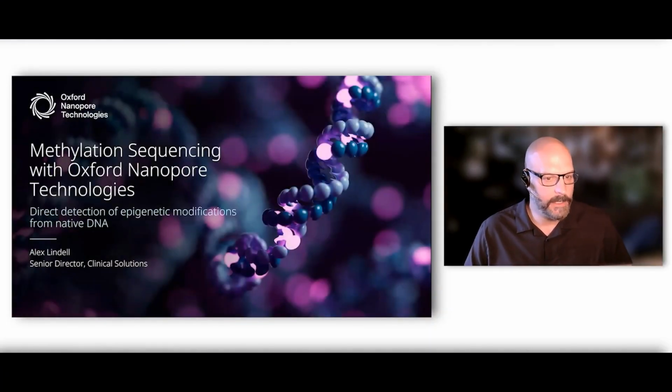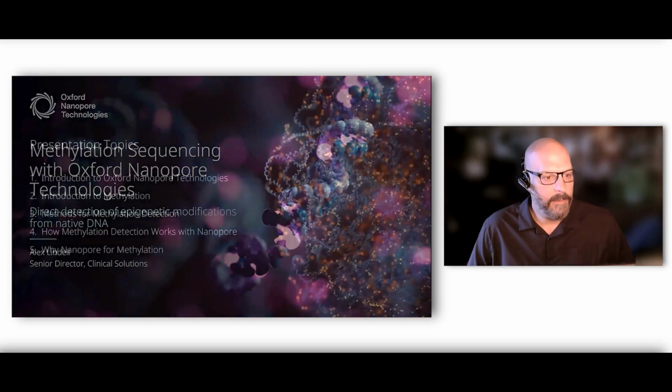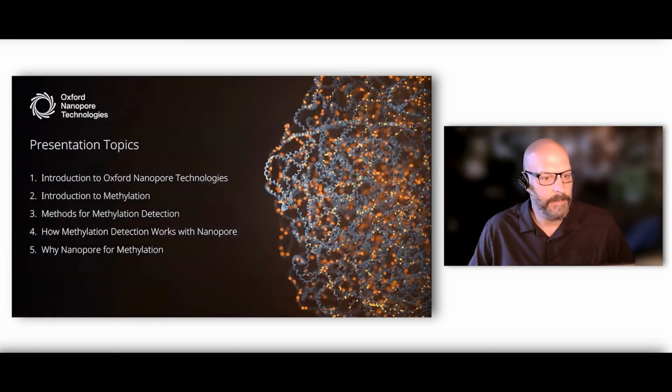I'm going to be presenting methylation sequencing with Oxford Nanopore Technologies. Just a brief overview before we get into the content with Tim and Jeffrey. I have 5 topics that I'm going to cover: introduction to nanopore sequencing technology, introduction to methylation, the different methods for doing methylation detection, how methylation works with nanopore sequencing, and why you should choose nanopore for methylation.